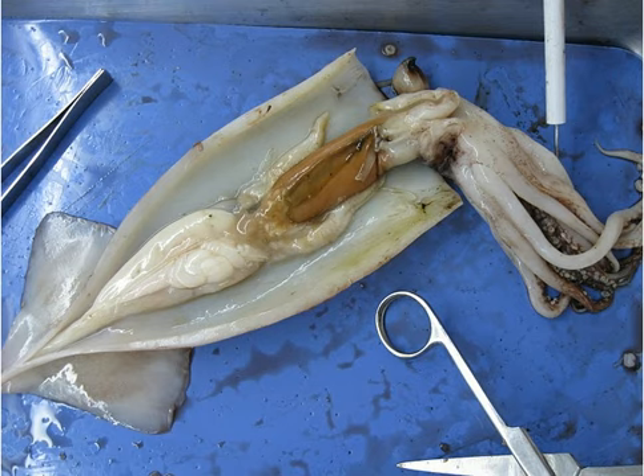These two long ones are the tentacles. This whole body part is the mantle, and these parts here are the fins. There are the eyes here, though we kind of took them out.